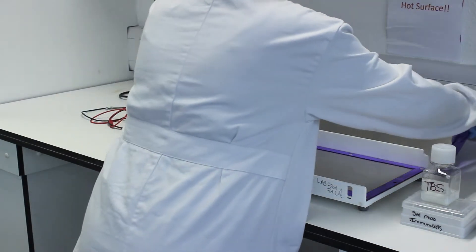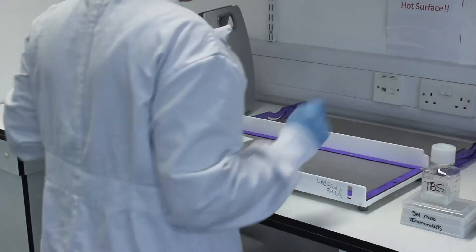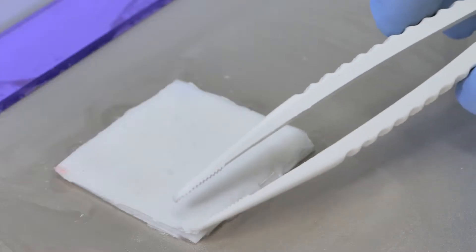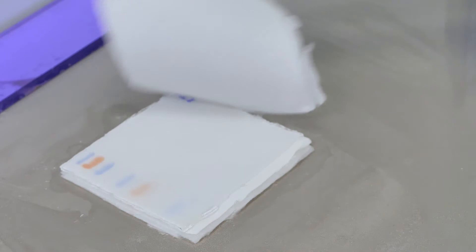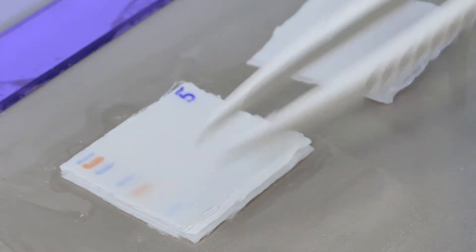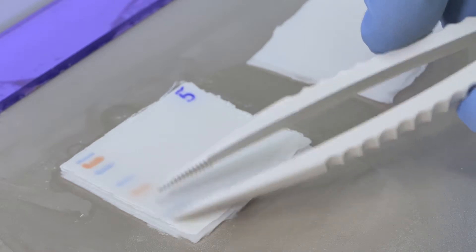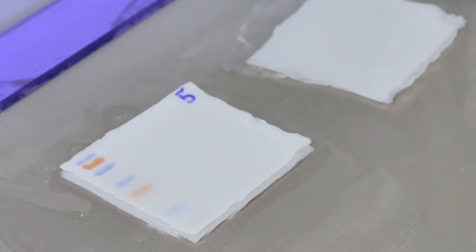After the one-hour electro transfer has been completed, the transfer sandwich must be disassembled and the nitrocellulose membrane removed. At this point you should be able to see that the bands from the protein marker have transferred from the gel to the membrane.